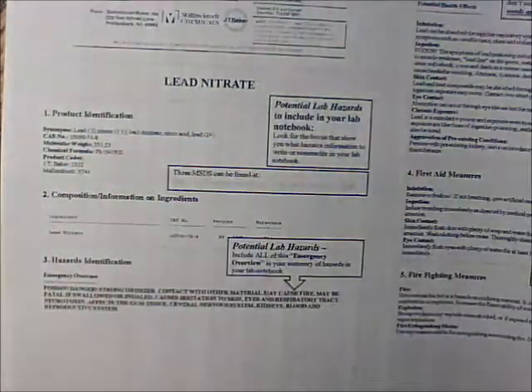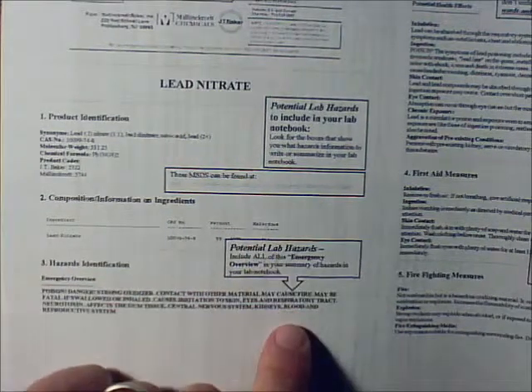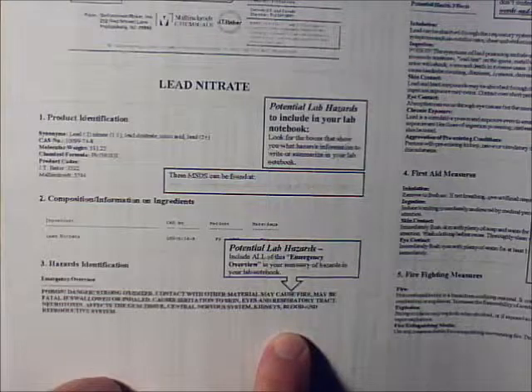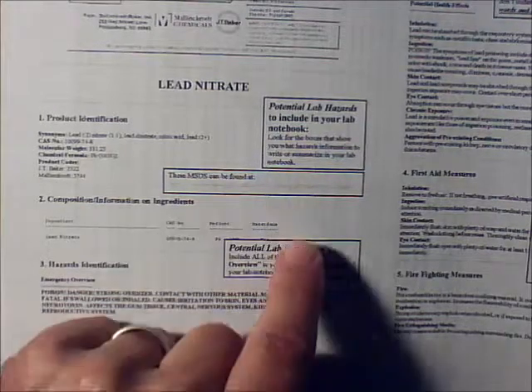I even took this first one. There are two chemicals in this lab. I took this first one and made some notes on here for you to help you figure out how to find the hazards you need in your lab notebook.